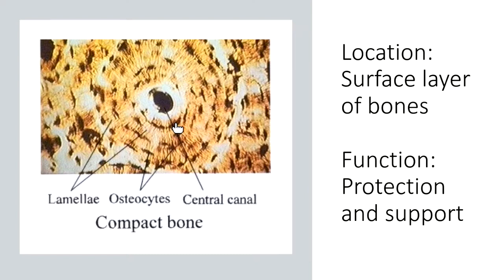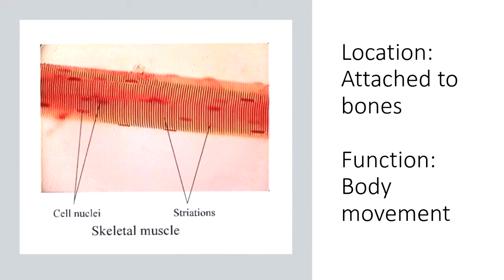Who lives in the cave is the osteocyte. Now, the last term that's on our list for labels, it's not on here, but it's on our list, is called canaliculi. The canaliculi are these rays that go inward and outward. And these connect these lacunae and these osteocytes so that they can all support each other. So that finishes up our connective tissues.